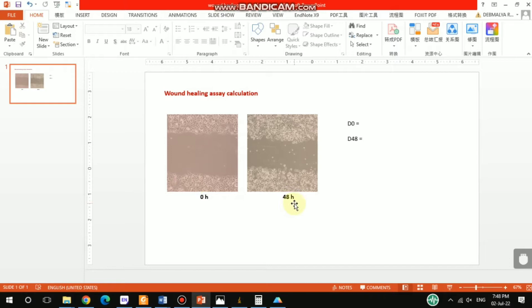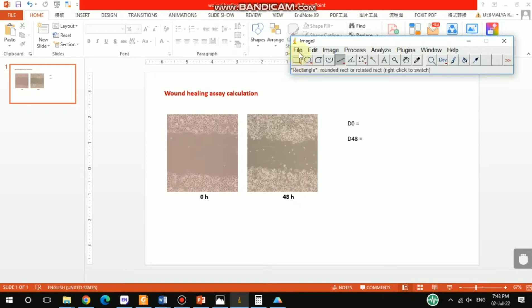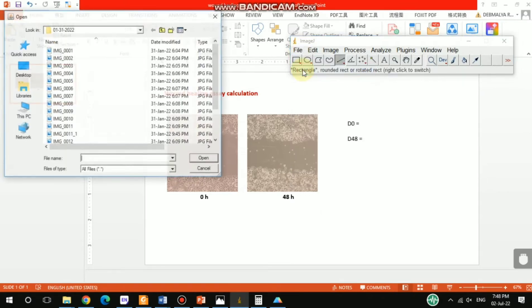I picked two pictures: one is 0 hours and another one is 48 hours. Instead of 48 hours, if you want to do 24 or 72 hours you can do the same calculation. D0 indicates the mean distance of the wound at 0 hours, and D48 indicates the mean distance of the wound at 48 hours.